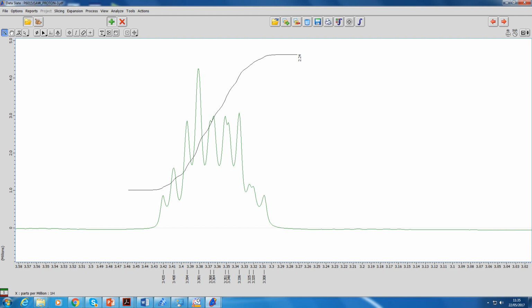It does get a bit complicated because of the position of the methyl groups, you can have a head to head or head to tail conformation. So the molecule actually might look a bit complicated rather than this simplified version here. But let's have a look anyway at the principle of overlaying.